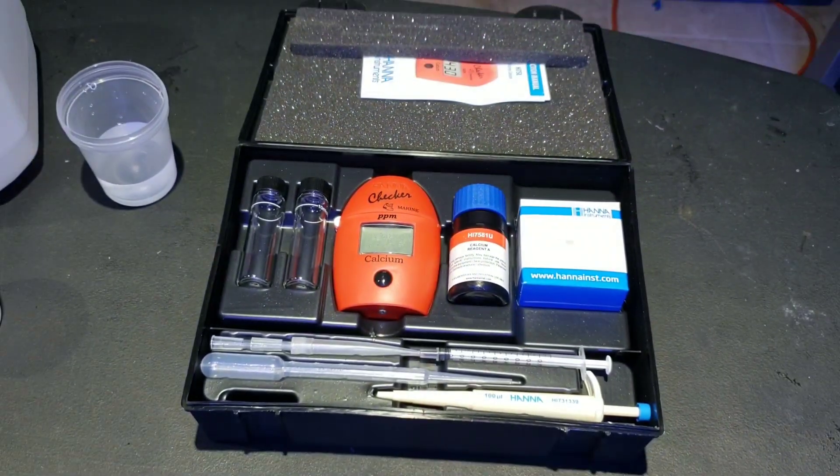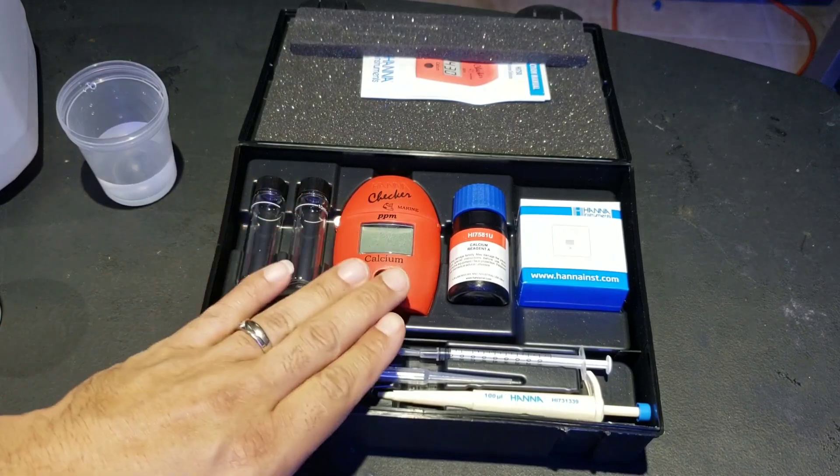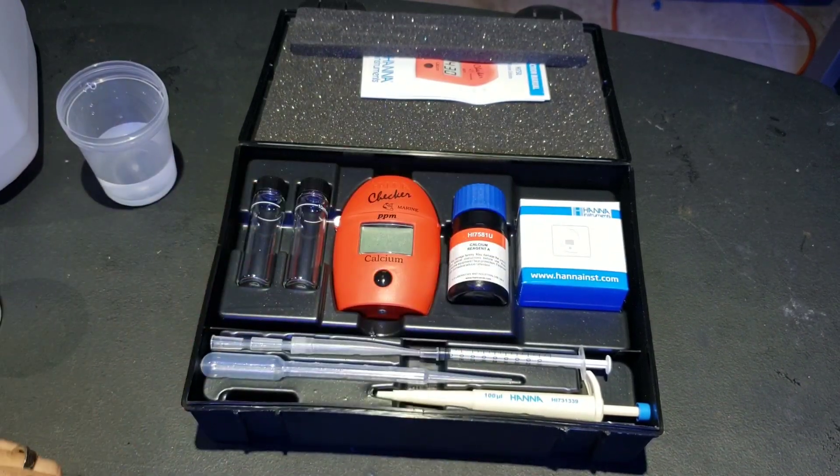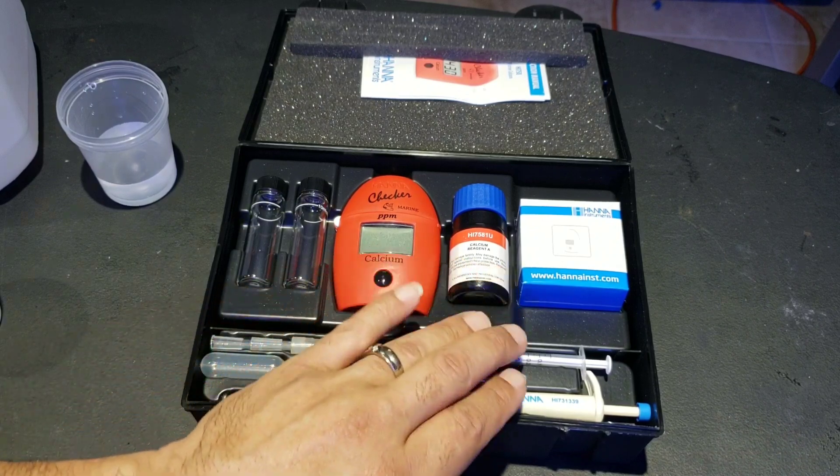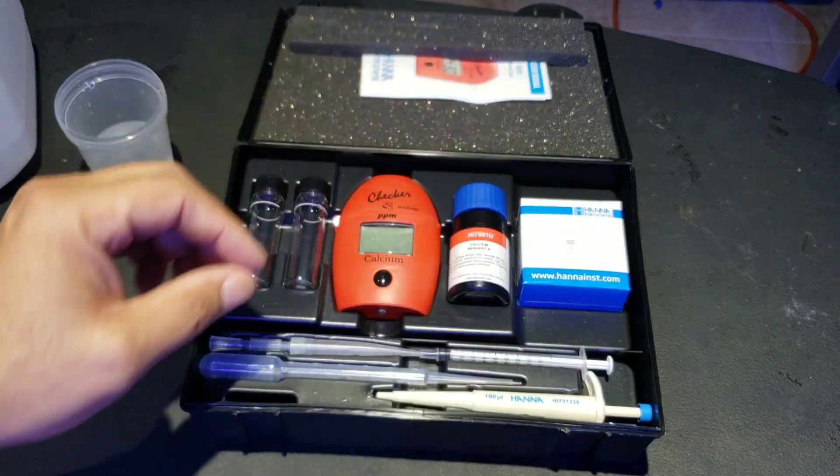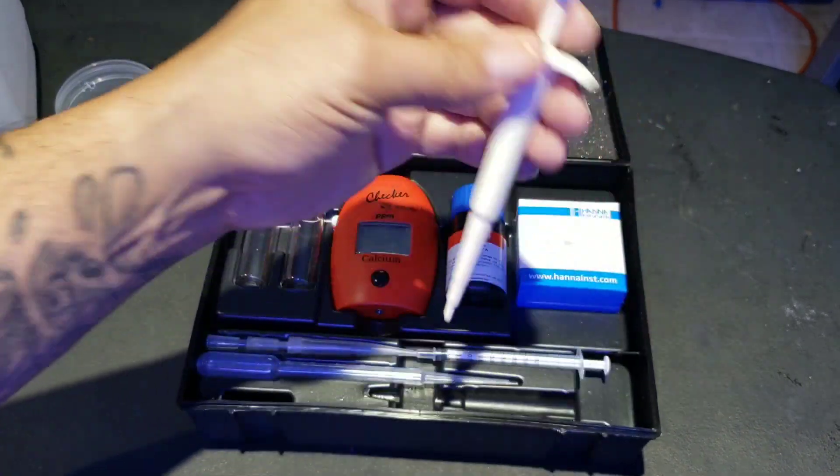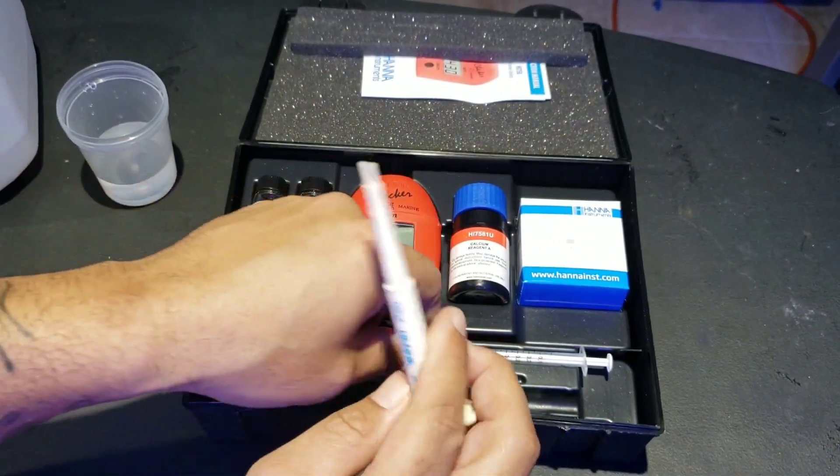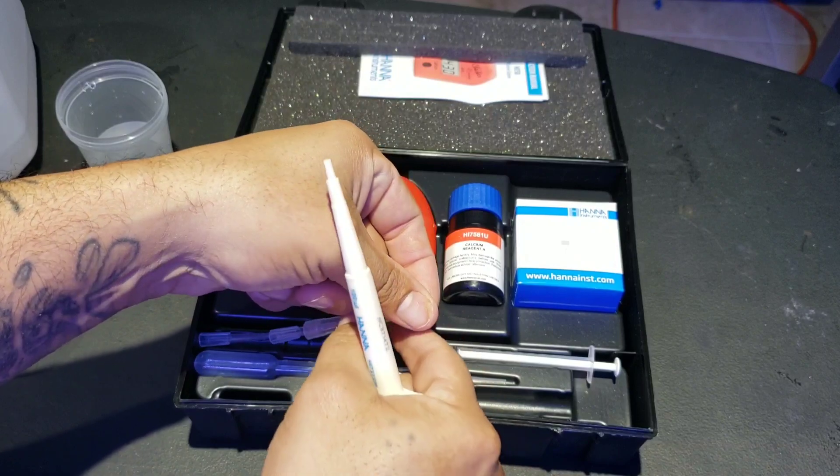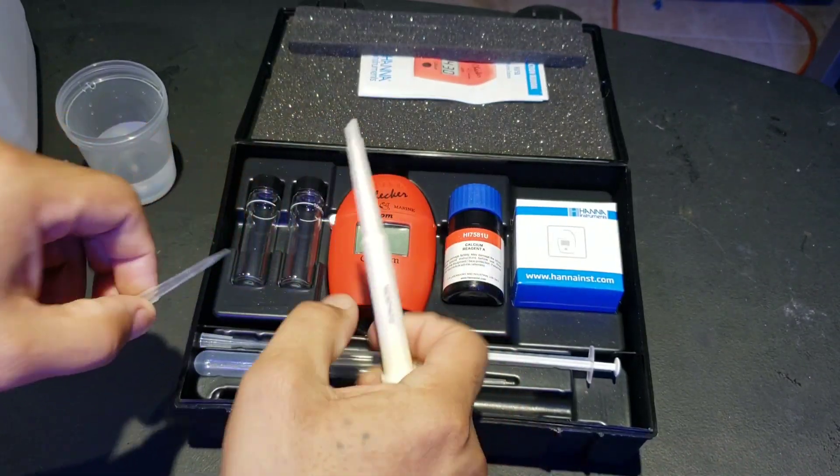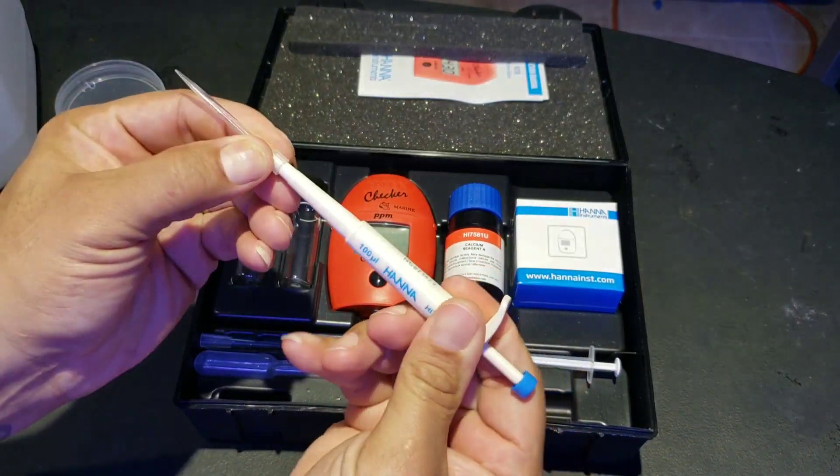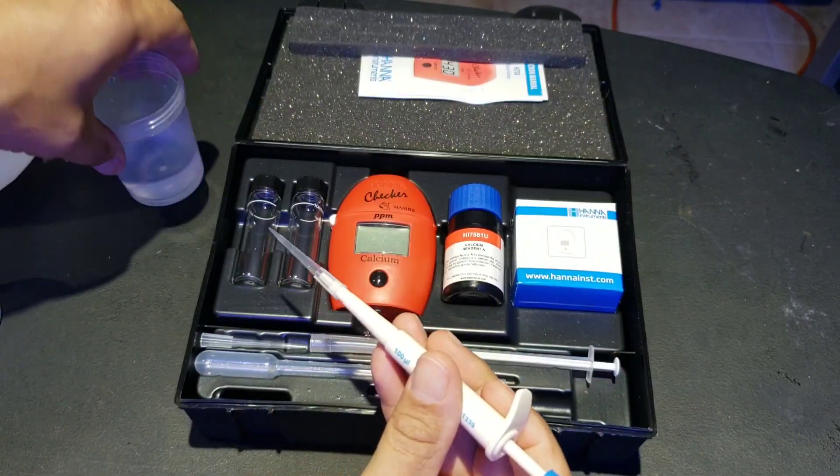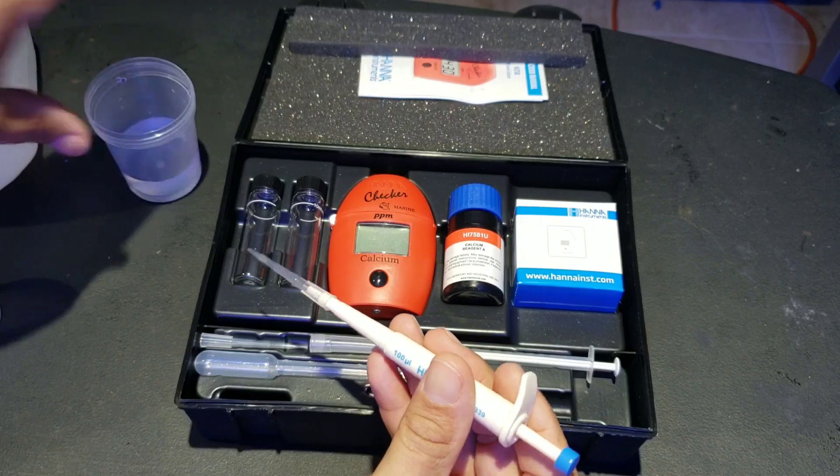So we have several things going on here. We have the cuvettes. We have the actual Hanna checker. We have the solution, reagents. You might as well say reagent A, B. We have the pipette here. Now, a lot of people had problems back in the day with this because it didn't come with this. This is very important for sample. I do have my sample water here from the tank.